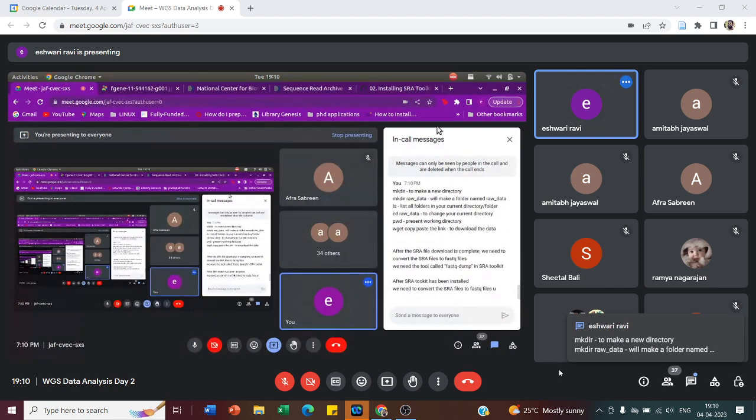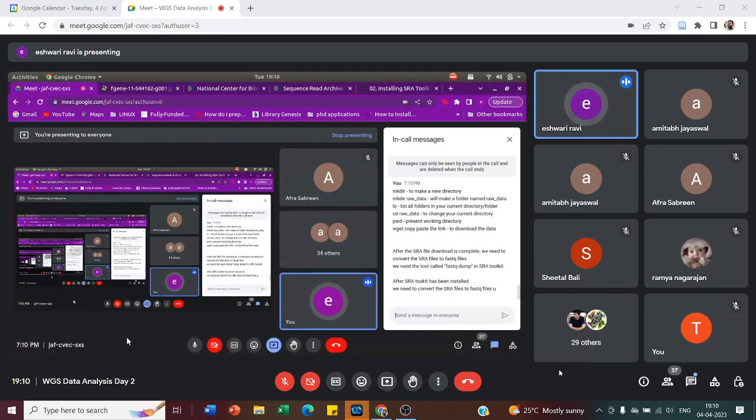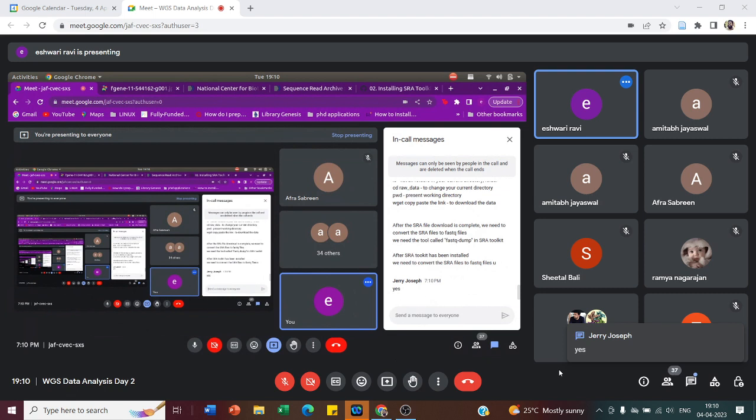Now, if you have finished your FastQC, is it okay if I proceed further? Please let me know. Is everyone on the same page, or shall I wait for some more 5 minutes?